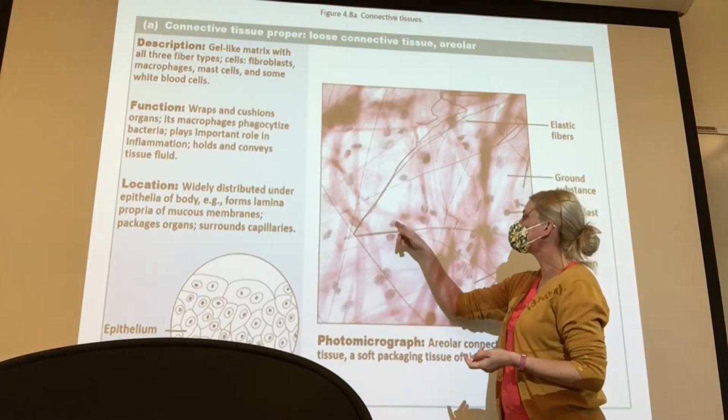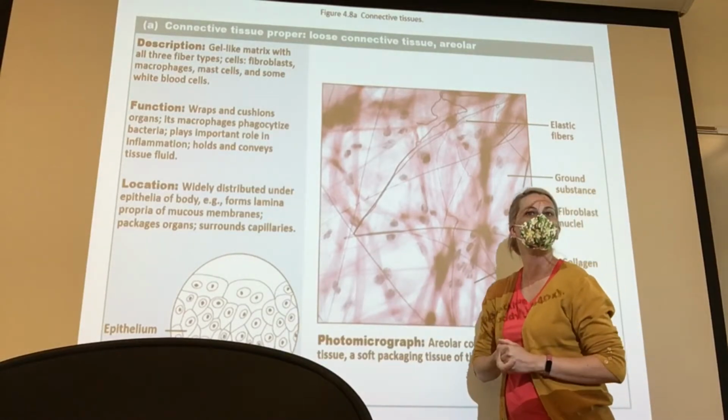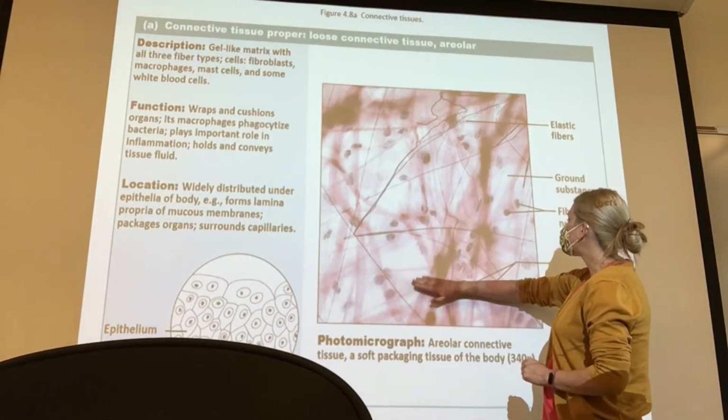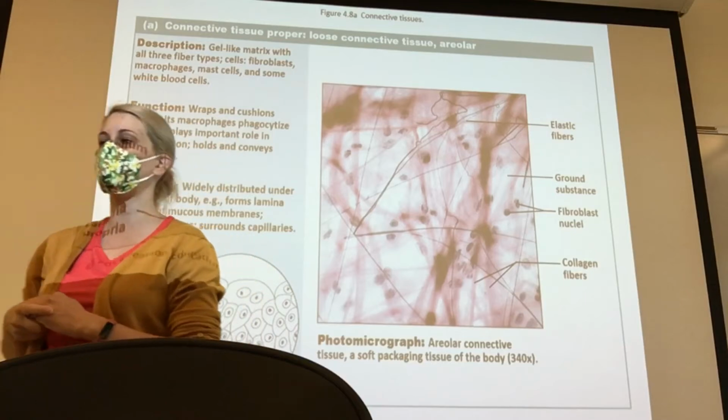The second thing is what the nuclei are doing. These little spots here are stained nuclei. That's where all the genes are, right? And then what the extracellular matrix, or the open field, looks like. In this one, it's very open field.